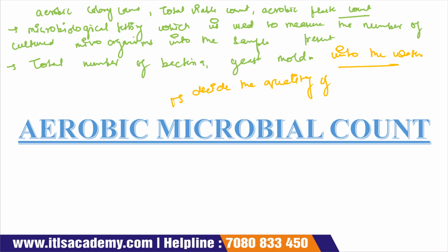This aerobic microbial count is also used to decide the quality of the sample. If the microbial load is too high, then obviously the quality of the product is bad. And if the microbial load is not too high, then the quality of the product is good. So that's why it is very important to determine the aerobic microbial count.